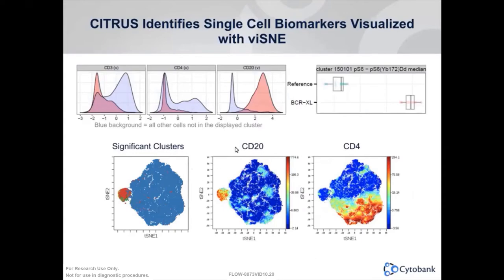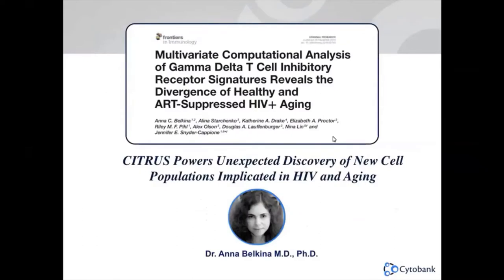Once the cluster is identified, you can overlay it back to your viSNE map. Once on the viSNE map, you can highlight with a third channel to check expression of lineage markers like CD20. You will see that the most significant cluster belongs to B cells. You may also turn on the phospho-S6 channel to see the expression level of that particular cluster. So I've shown you how you can use Citrus and the data visualization and interpretation tools within Cytobank. If you have any questions, I'll be happy to take them during the Q&A session.